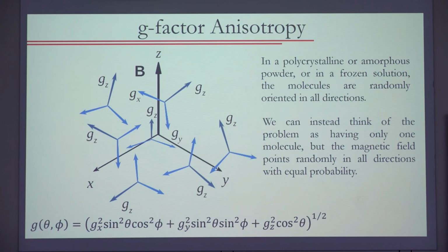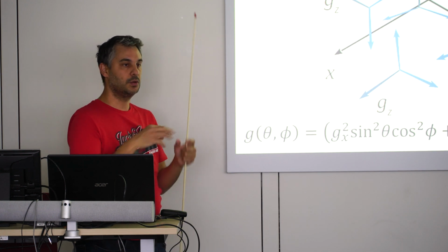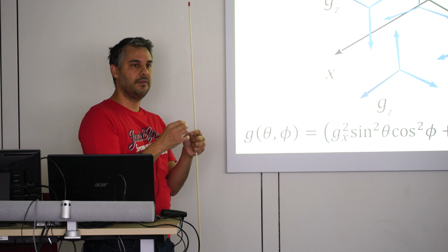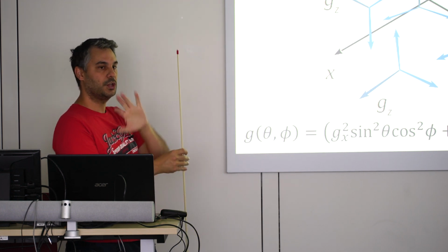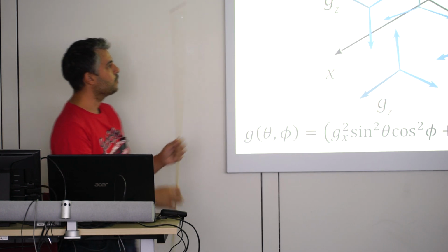So, but why am I measuring this? Let's say you have a powder. You don't have a single crystal, you have a powder that's like ground single crystals. You should always grind single crystals if you can. Don't use a powder directly from a precipitation, because it may have some small crystals and not so small, and then it's not completely random. It's better to grind it before doing this.